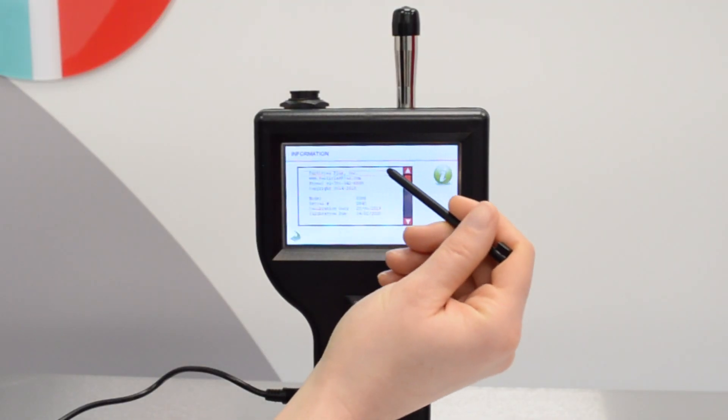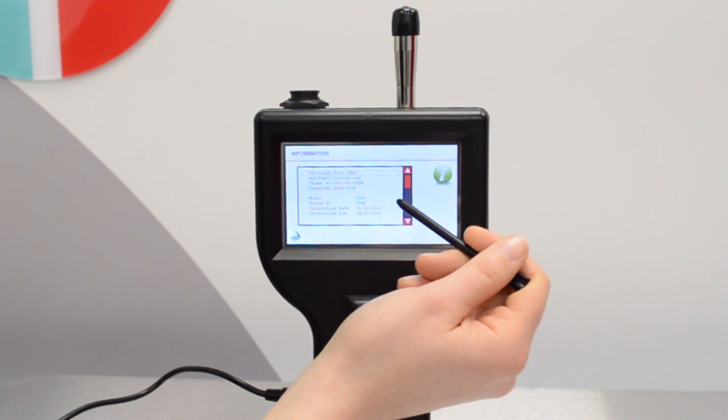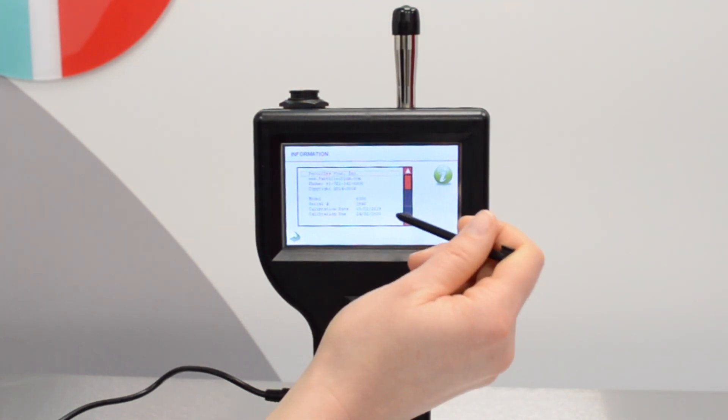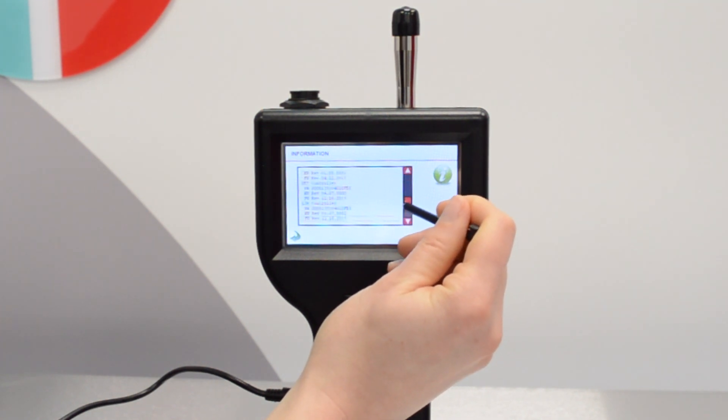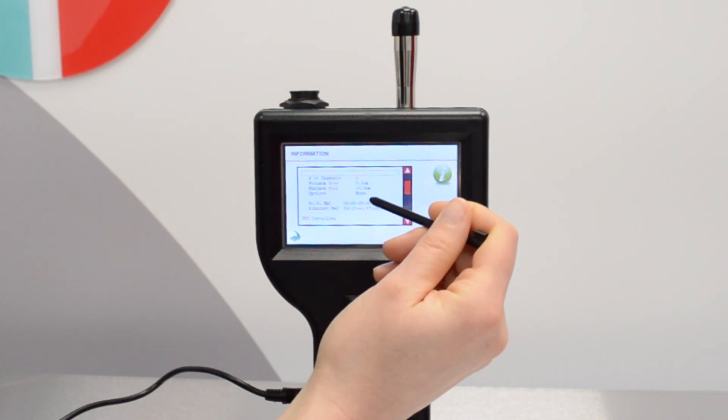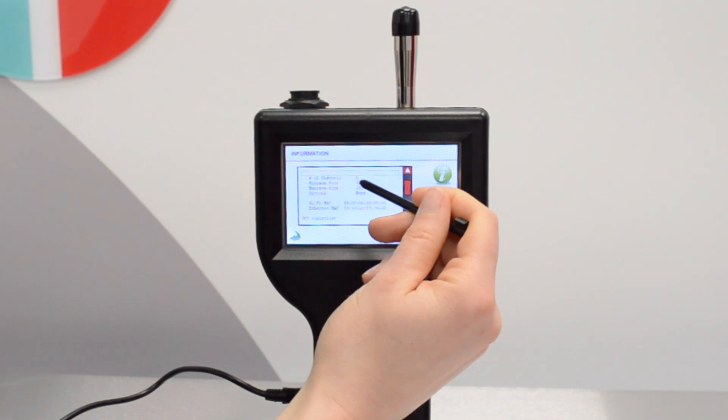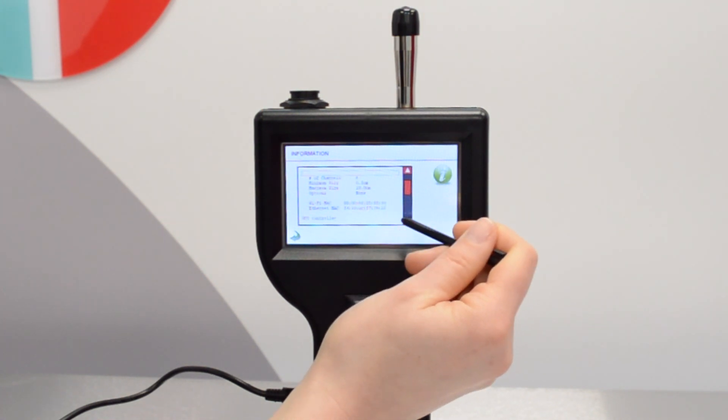Tapping on the Particles Plus logo takes you through to an information screen that gives you information on the manufacturer, the model number, the serial number, the calibration date and the calibration due date. It also gives the number of channels from the particle counter. This one is a six channel and some more information on the software.